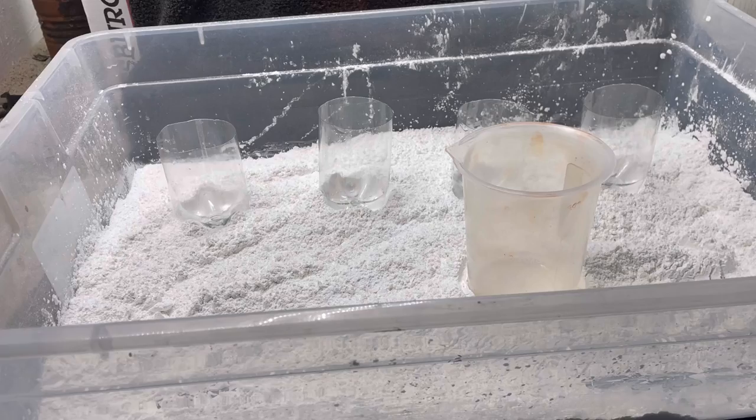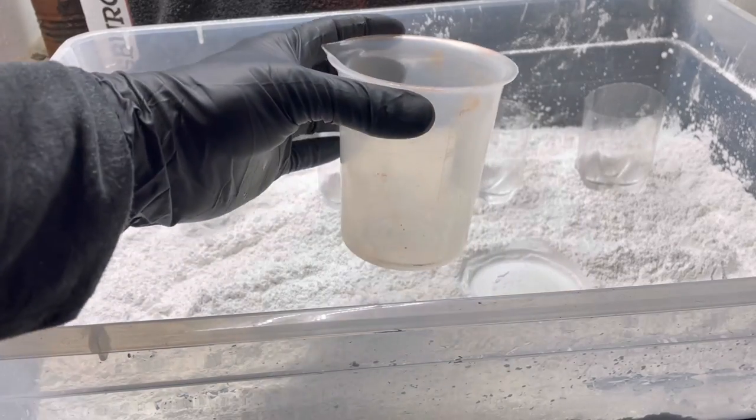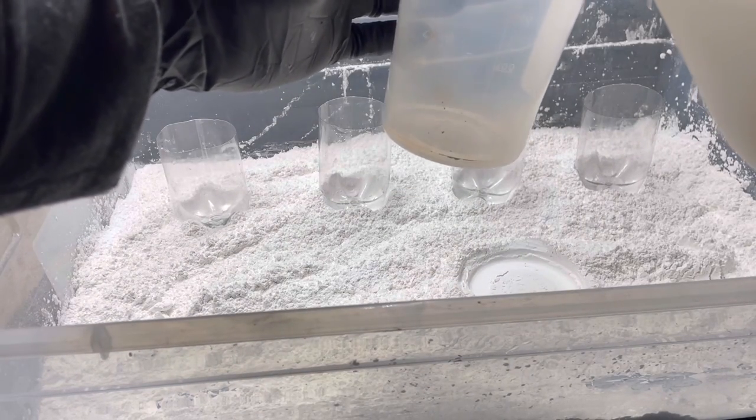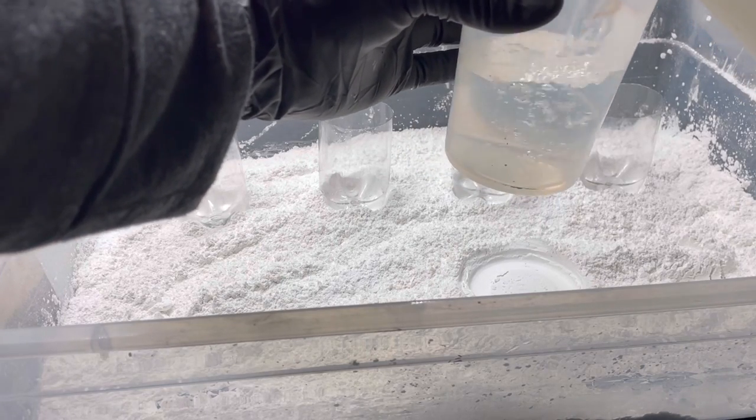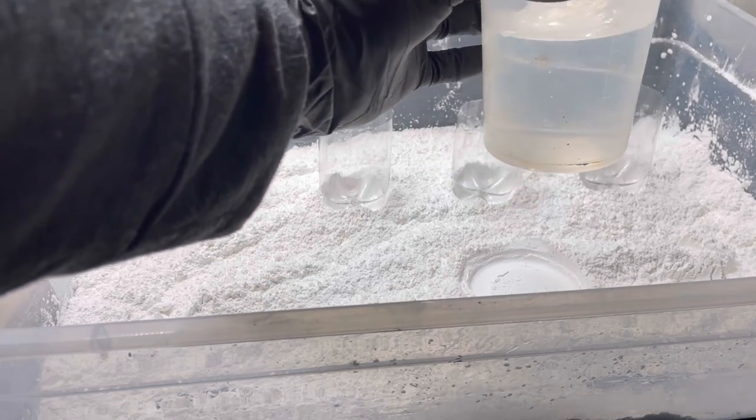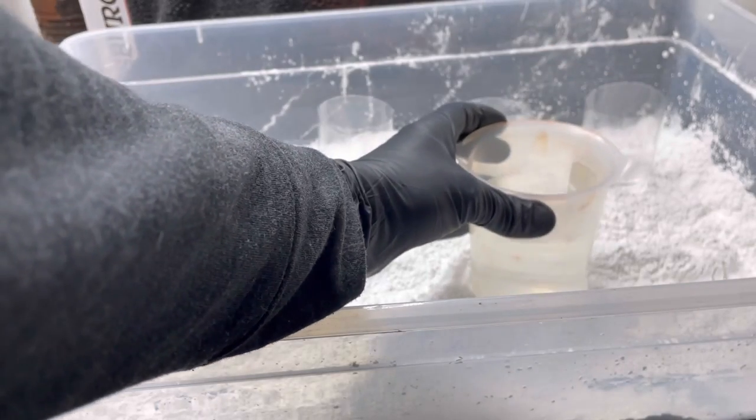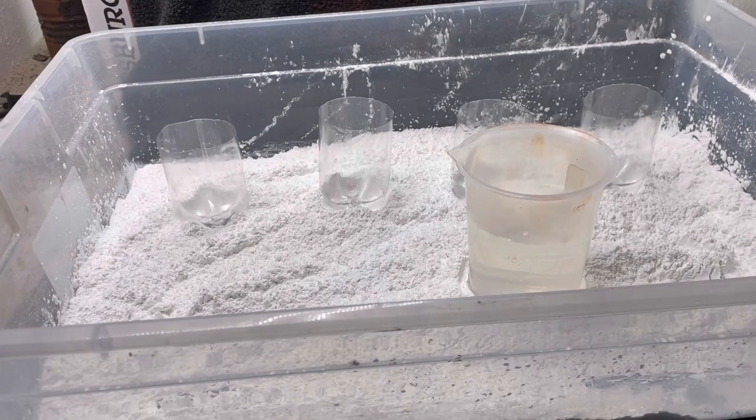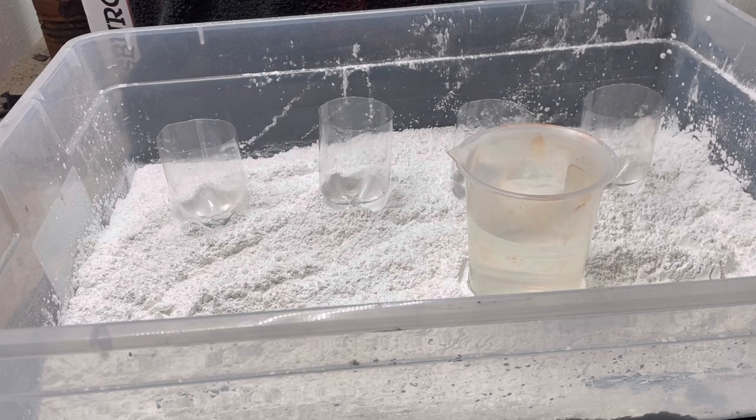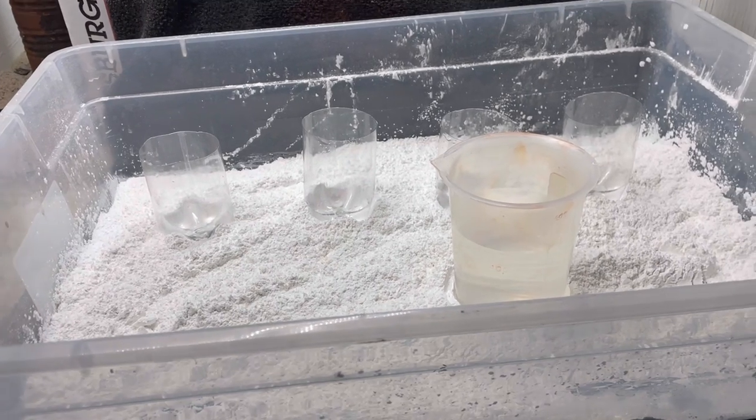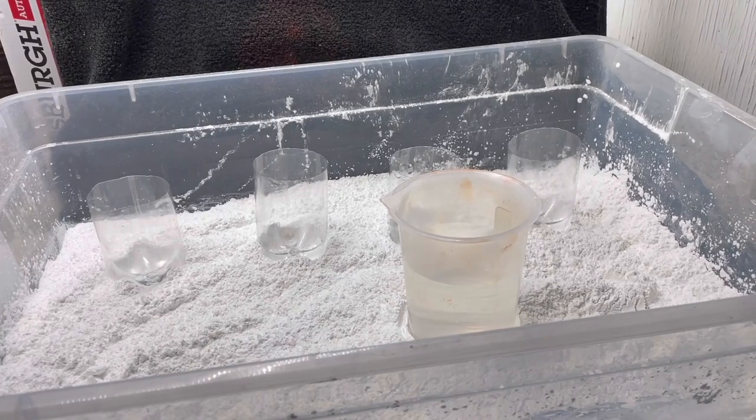So this acid is able to dissolve glass, metal, ceramics, flesh, but it is powerless against plastic. Which is why everything I'm using here is made out of plastic. I've also got this tub full of lime to catch any drips and neutralize the acid and the vapors I produce should be pulled away by the fan you can hear running.